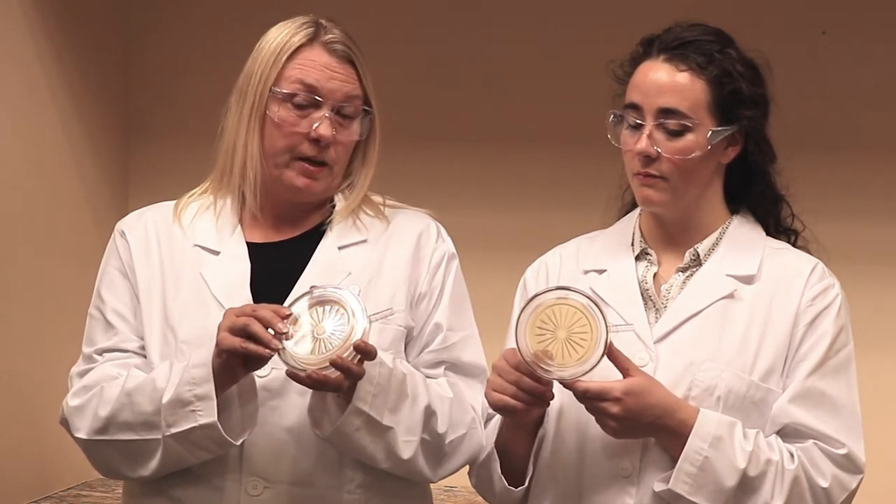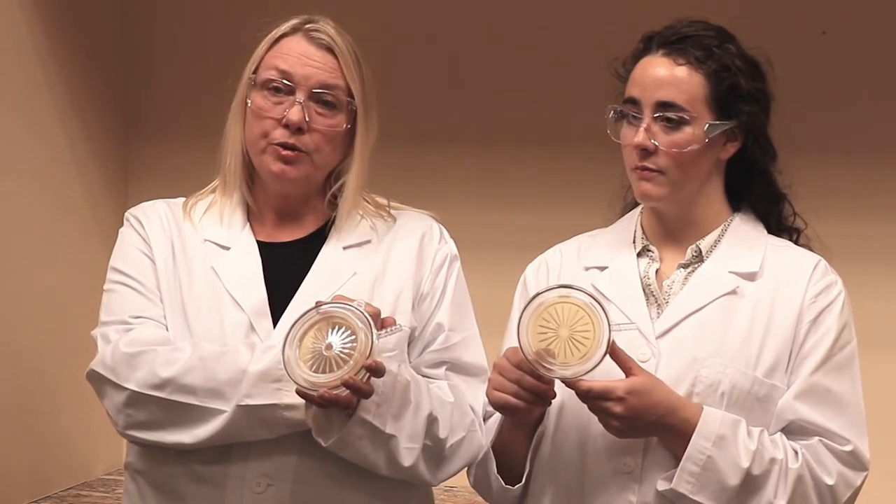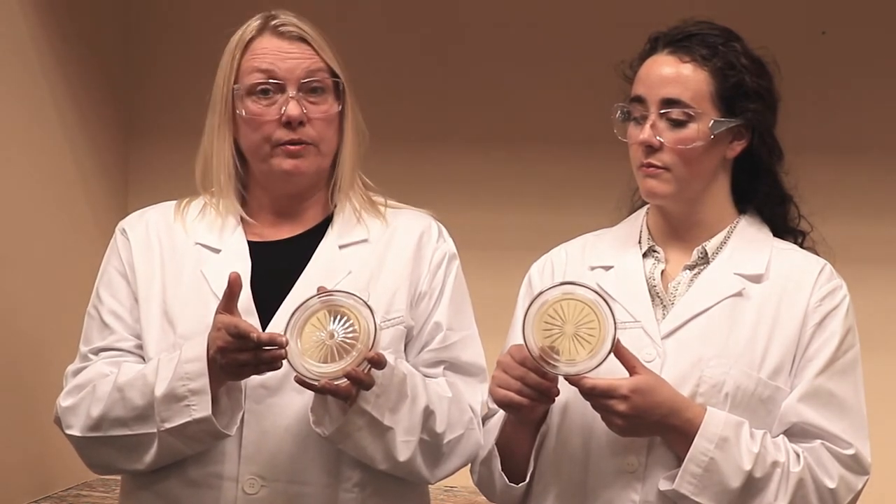You'll want to know what type of agar is inside of each plate. For the 25/50, you can choose TSA, TSA with neutralizers, or SDA. The BioCap Single Use 100 liter per minute only comes in TSA with neutralizers.